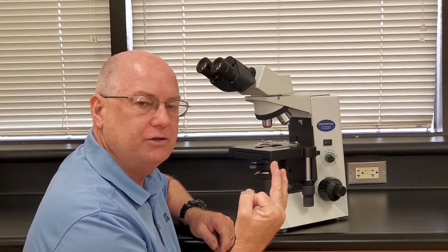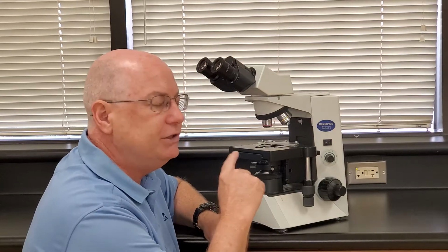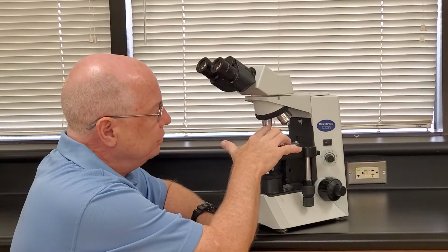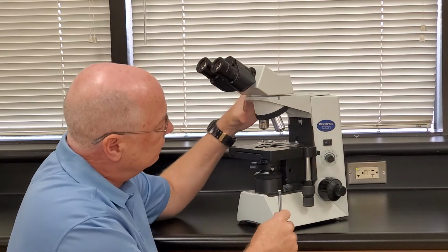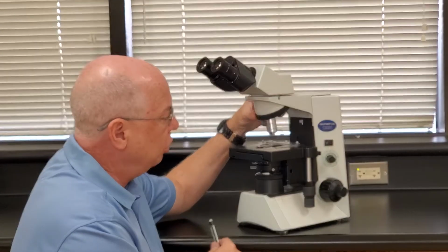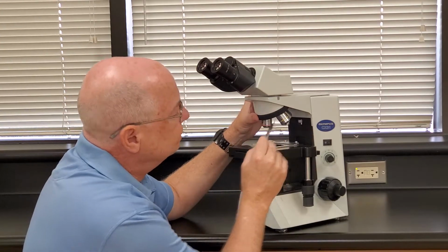The objectives, there are 3 of them usually on our microscopes, at least the ones that we use, although they do have a slot for a 4th objective, we don't use it. These objectives, if you notice, one has a red line, one has a yellow line, and the other has a blue line, and if you look at them, each one is progressively longer. And if you look at them closely, there are some numbers on the side.